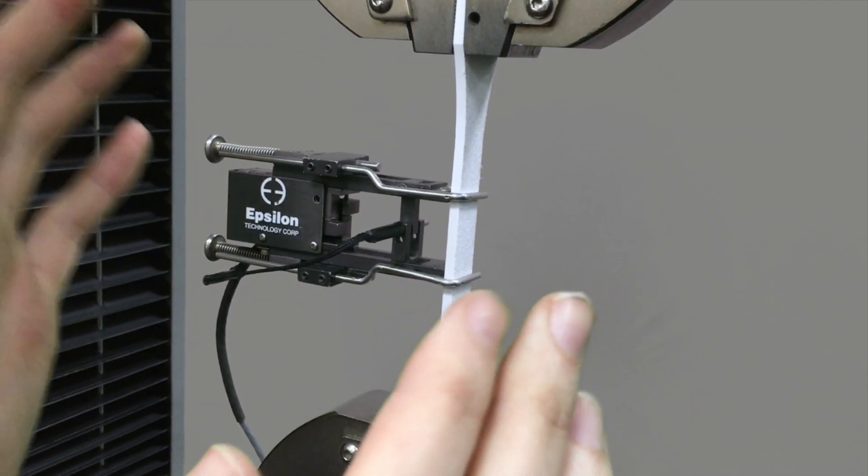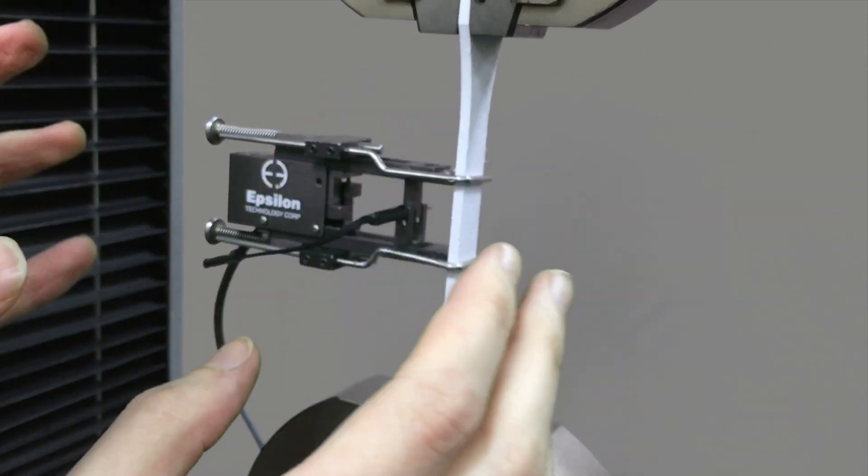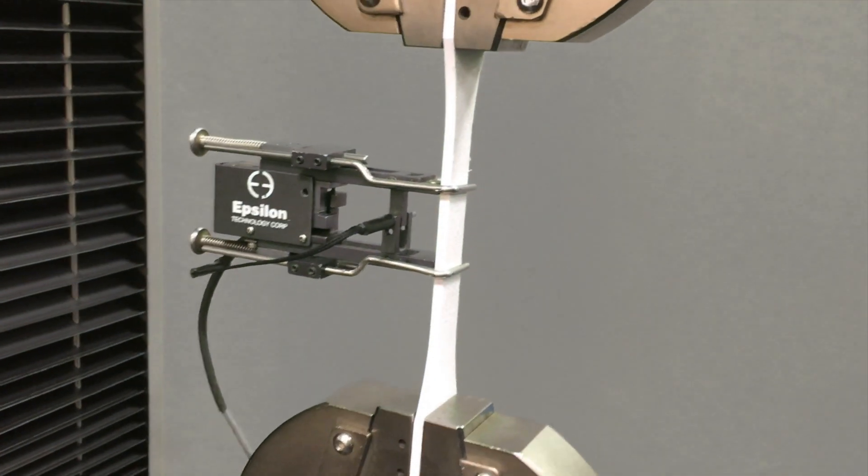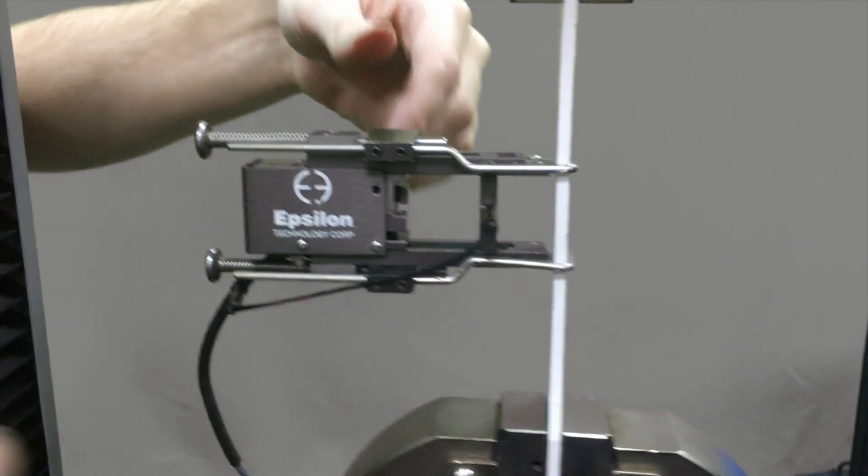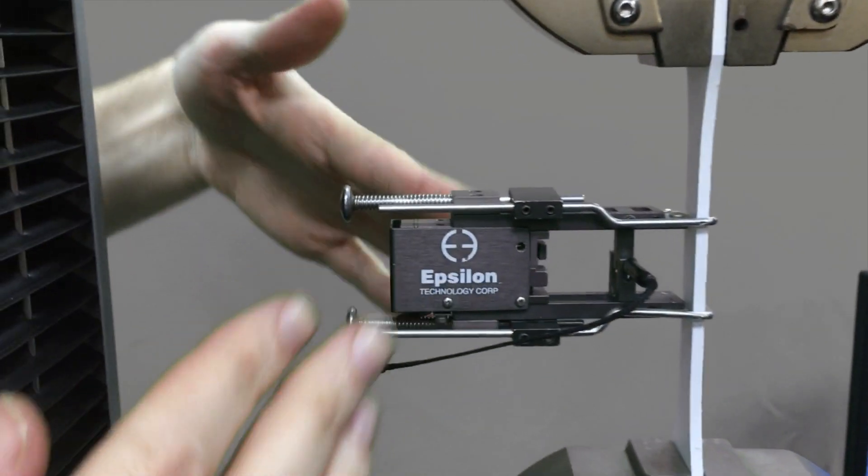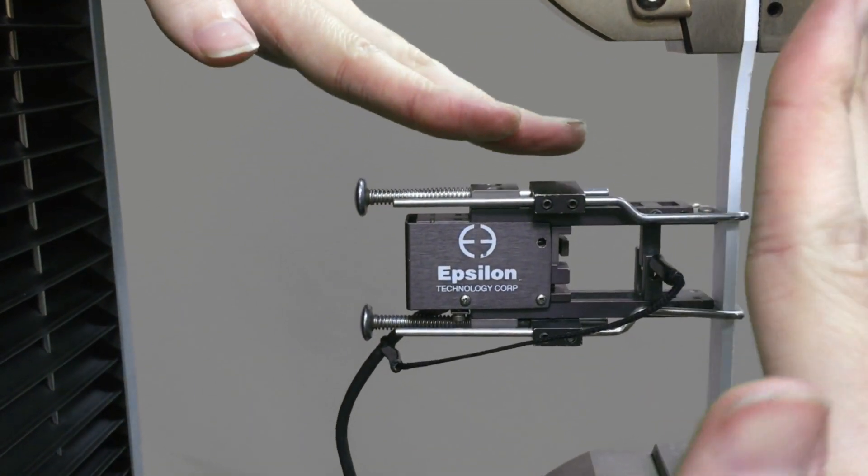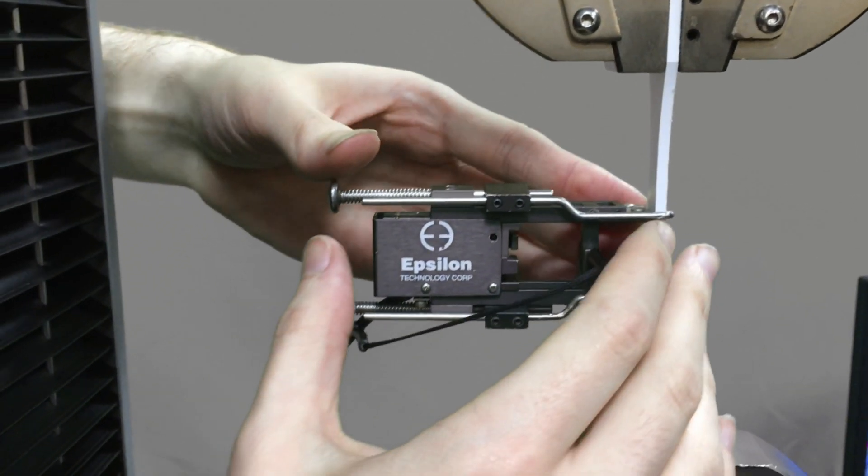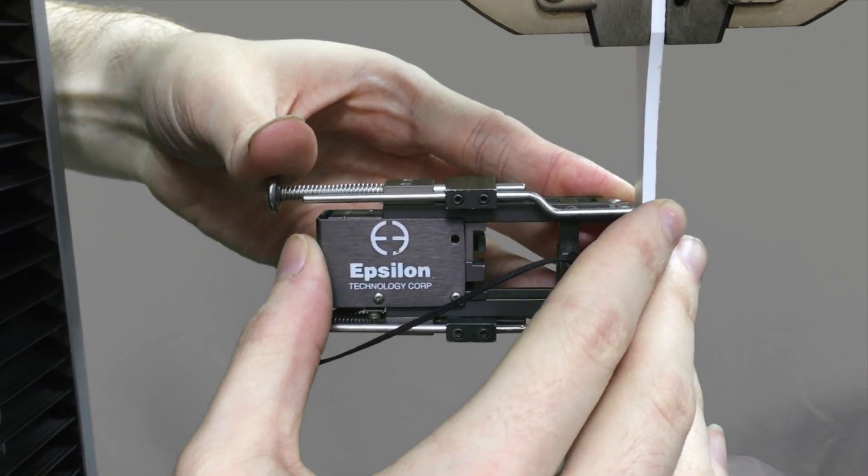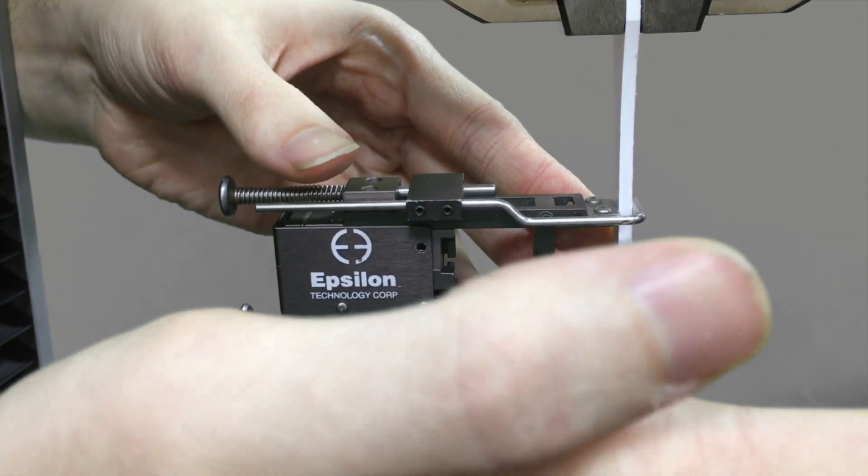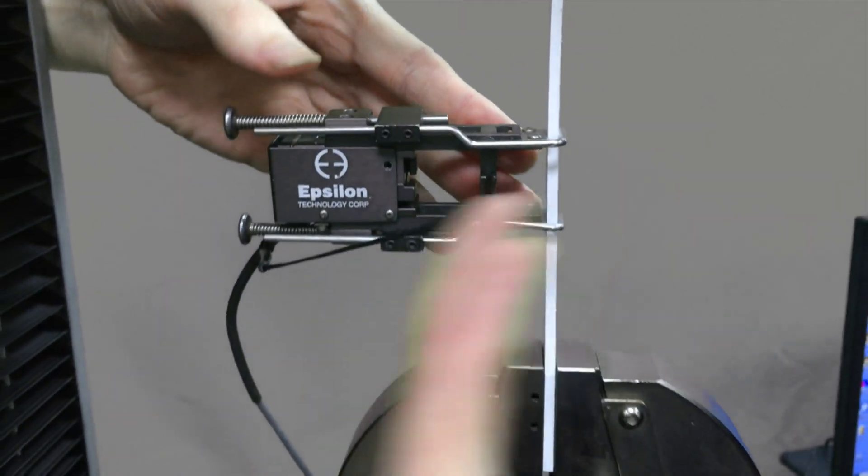And now the extensometer is on our sample. Another important note, besides the gauge length, is to make sure that the teeth are perpendicular to your sample. You want this to be lined up nice and straight. You don't want it wonky coming off the side like that. You want it nice and perpendicular.